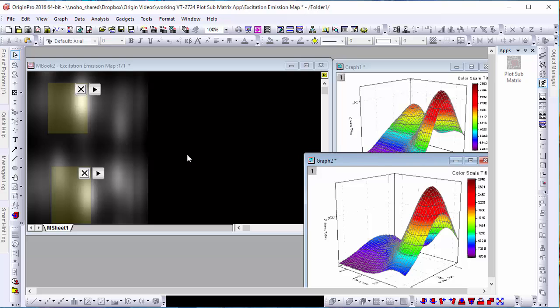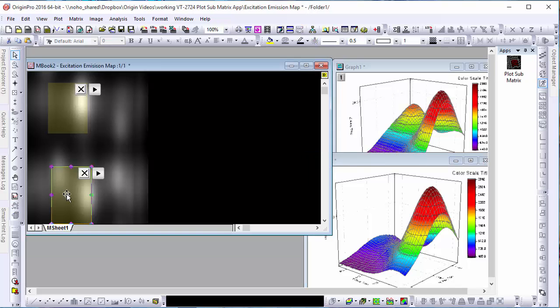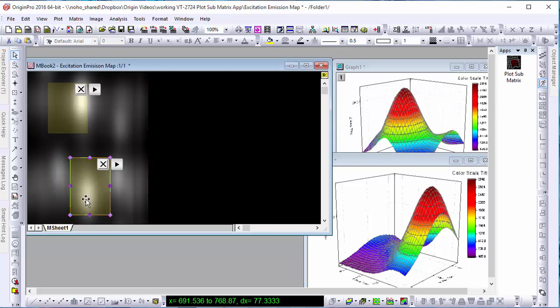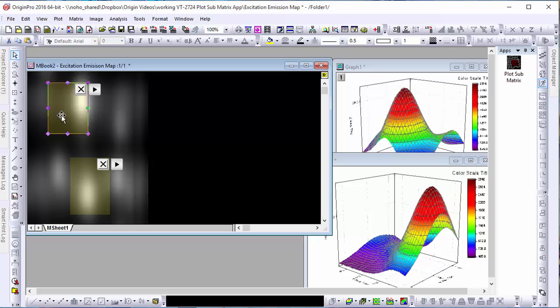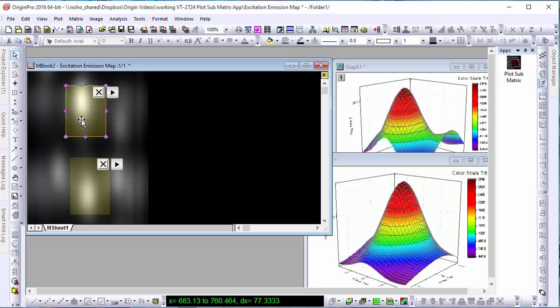Once we're satisfied with the range selected, we can close the app, leaving the last selected section as our graph.